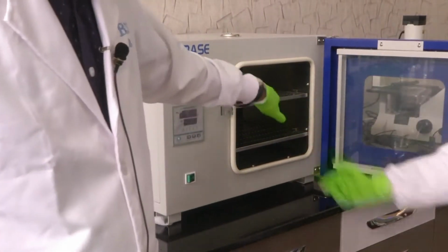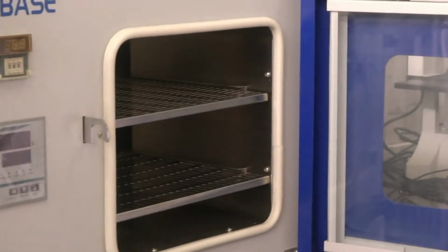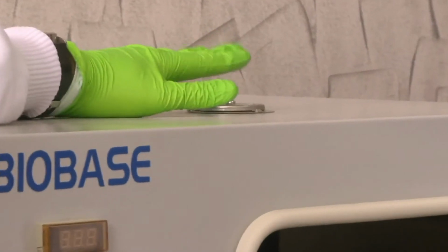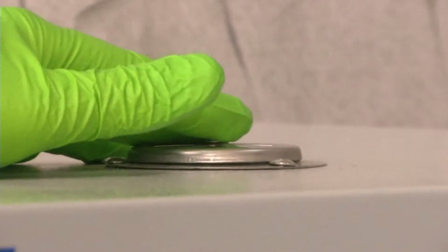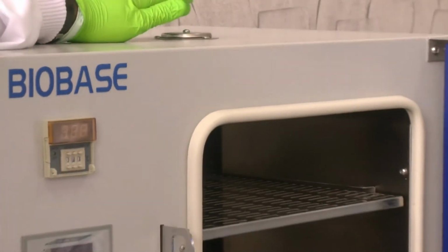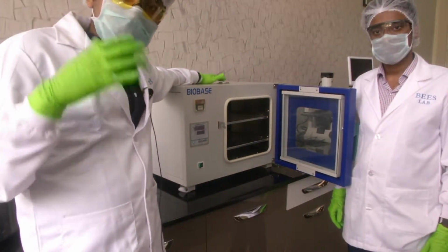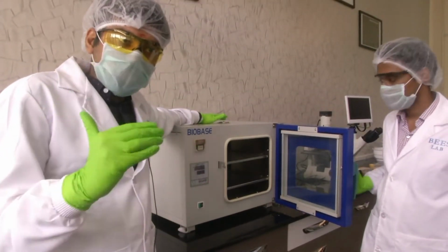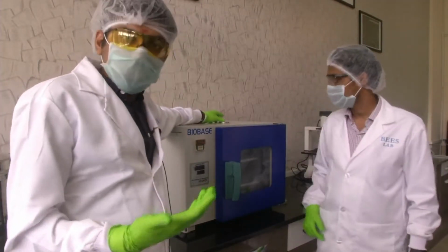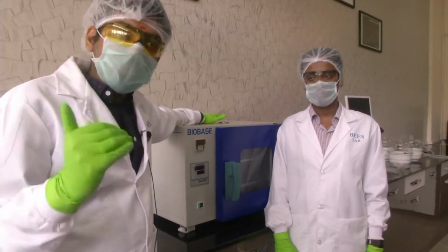At the back, you cannot see it here, there are coils and fan arrangements that are used by the control system in this oven to maintain the set temperature. There is a small metal part above that acts as a kind of exhaust. Let us say we set the temperature of the oven to 70 degrees Celsius, but this is a physical, practical equipment. In trying to reach 70 degrees Celsius, it might go to 75 degrees Celsius, and the control system has to come back to 70. At that time it has to vent out some heat. For that, it will use these exhaust knobs to control the air inside or to take in new air, so that the set temperature can be arrived at.